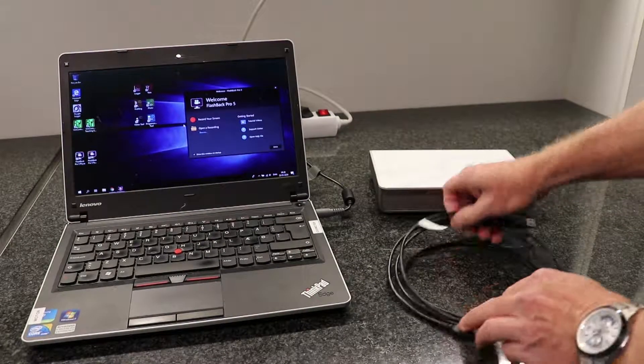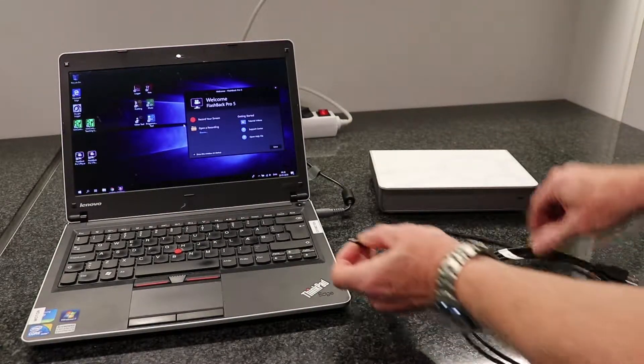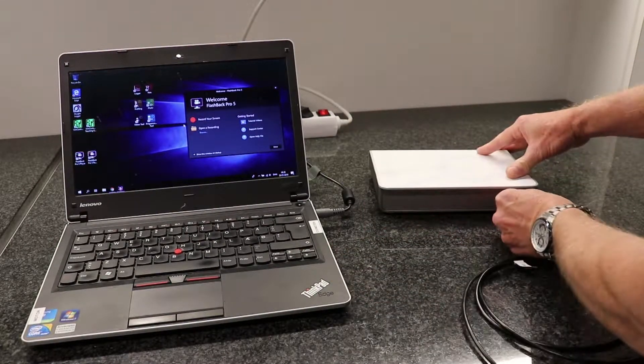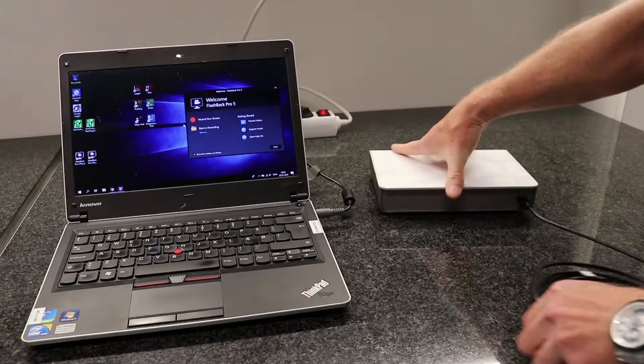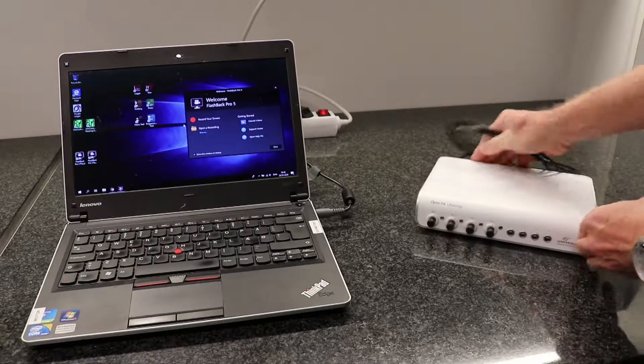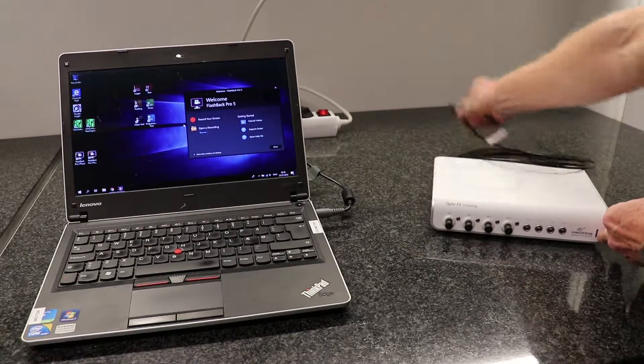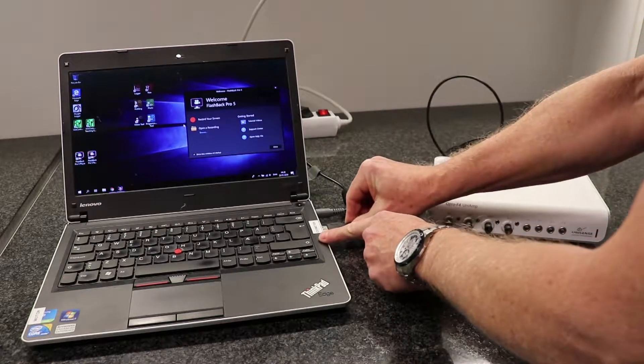First connect the meter. Use the USB-C cable and connect it to the computer. Use the USB port designated for the optode meter.